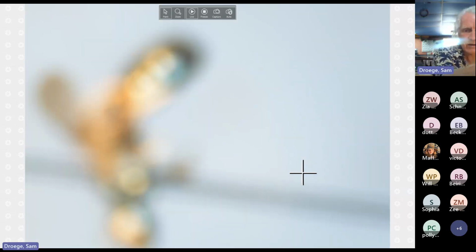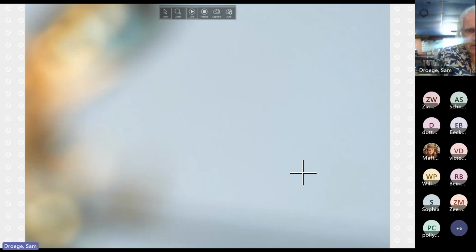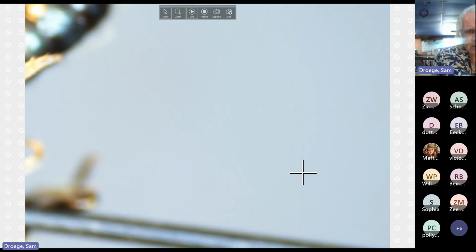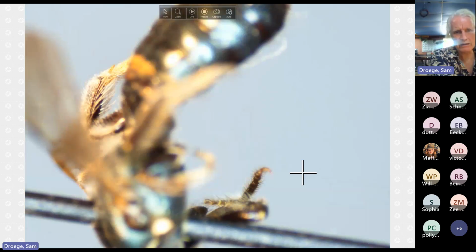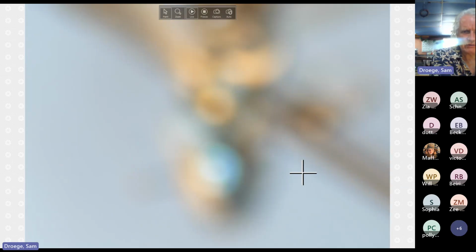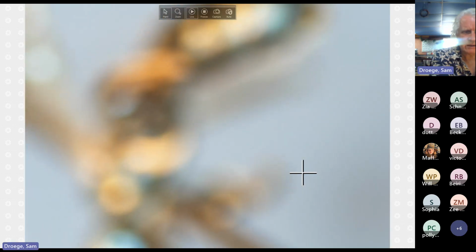But if you don't have comparative material and haven't looked at a bunch, you might call that something else. Or is that a lot or is that not a lot? You know, it's not a lot compared to Osmia. It's just a lot in comparison. Okay, I didn't turn this enough to mikmaqi. Dupla seems to have some, but it's not a character we use in dupla. It seems to be more in between, I would call it.